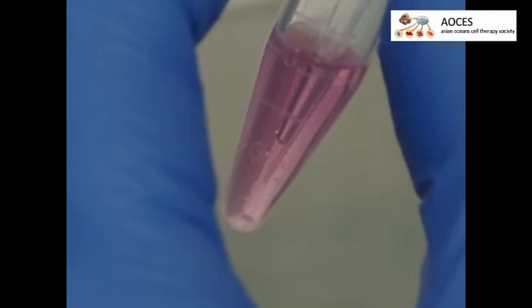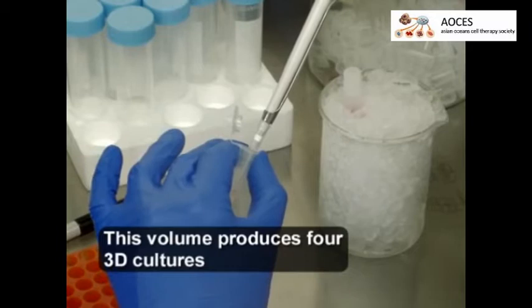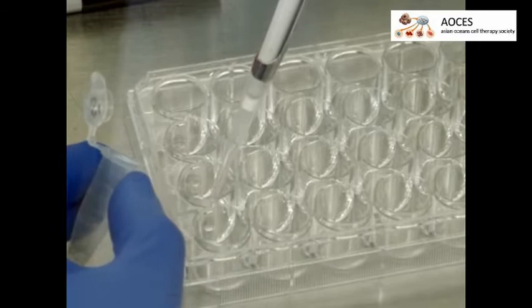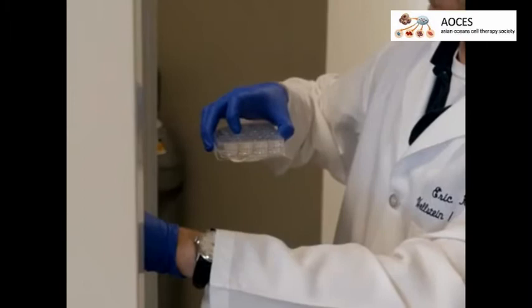Pipette 40 microliters of cancer cell spheroids from the bottom of the 1.5 milliliter centrifuge tube and combine with the ECM mixture. Now, pipette 40 microliters drops of this viscous mixture into the center of individual wells in a 24-well cell culture plate.